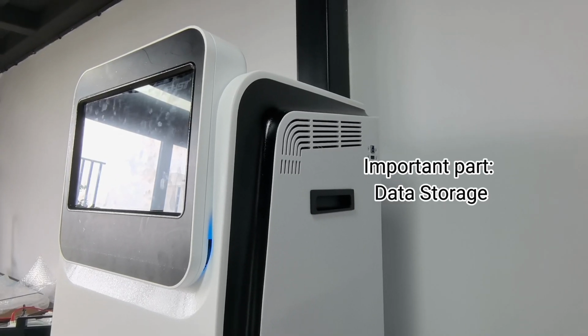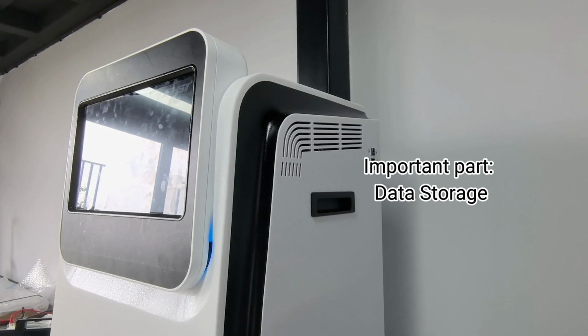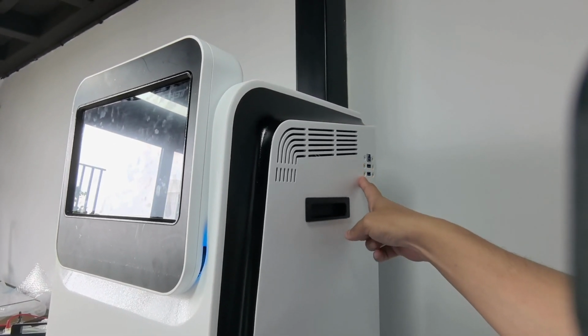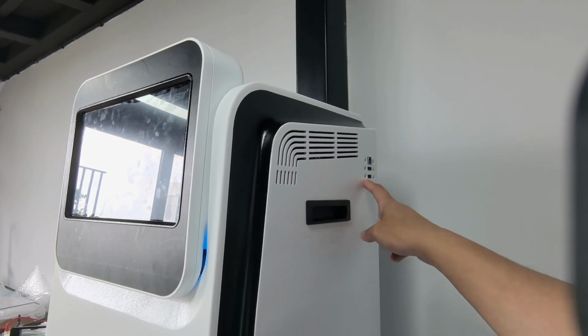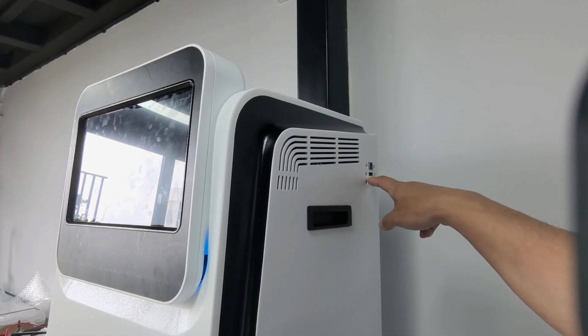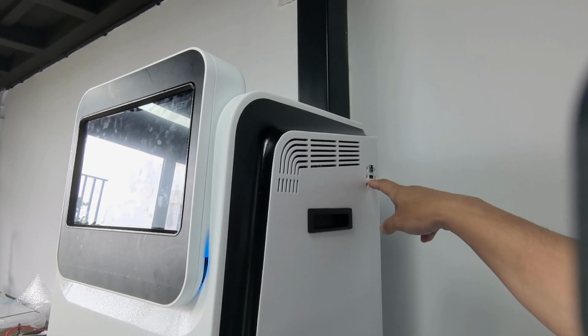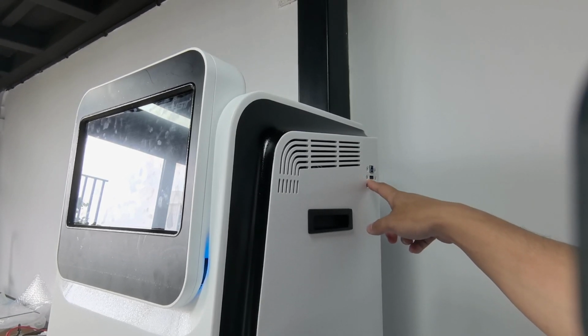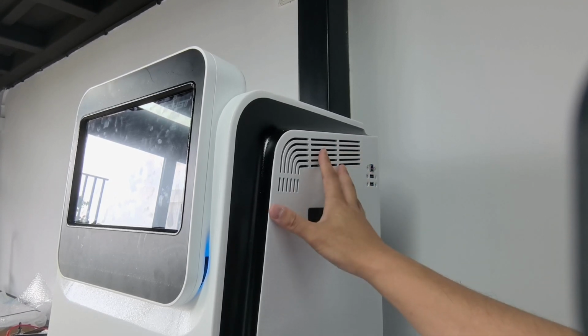The auto saving and save as functions. As I have already mentioned, we have two USB ports here. One is for the external SSD, the external hard disk. Another is for the flash disk. The external hard disk is for the auto saving of our system.